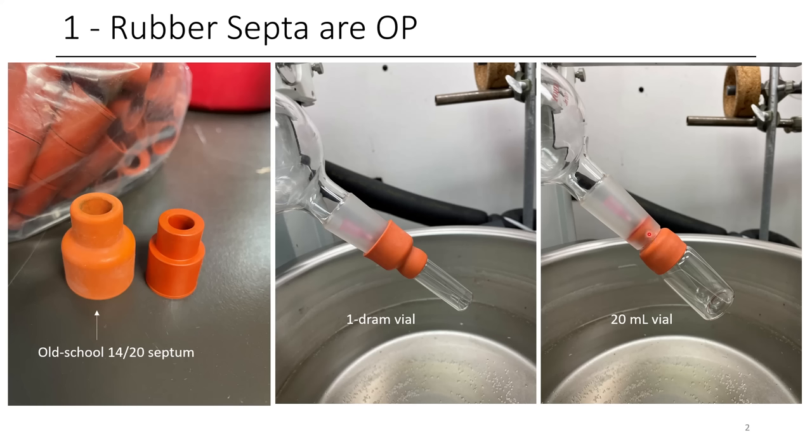However, when you reverse it, the inside 14/20 part is able to slip inside and fit perfectly and snugly inside of the inside of a 24/40. So this is really useful for rotovapping stuff.